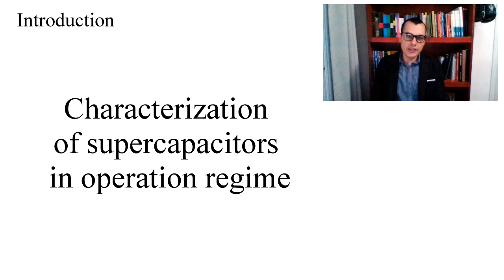The last 20 years have witnessed a huge growth of Raman in-situ studies. In-situ may mean operando studies. To say that the study is done under operando conditions is the same as to say that the study is done charging and discharging a certain device. Such studies become an important tool to identify or measure properties of energy storage devices such as batteries and supercapacitors.